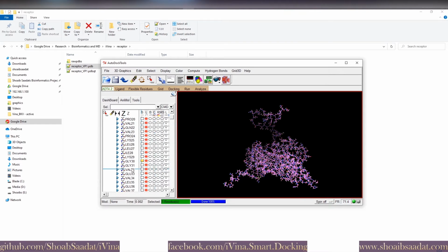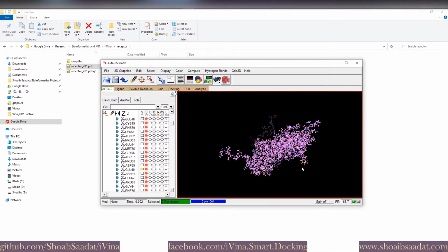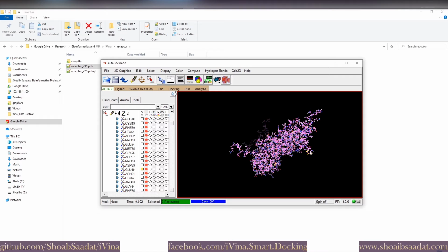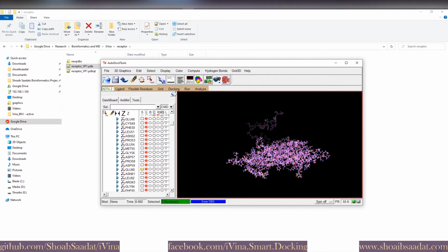Let's select another residue here, just to increase the dimensions. Say we've got glutamic acid here, which is around here. So we've got two of these selected, as you can see, these yellow selections. One of them is glutamic acid and the other one is the glycine.